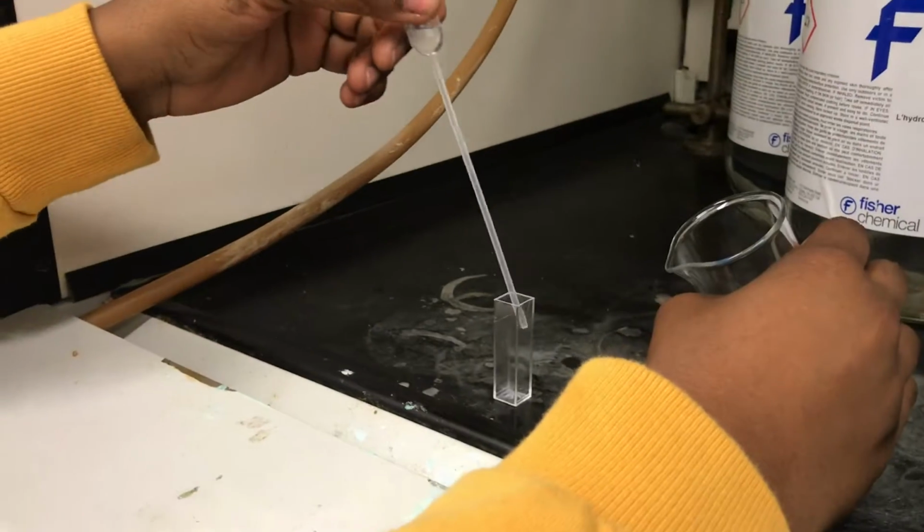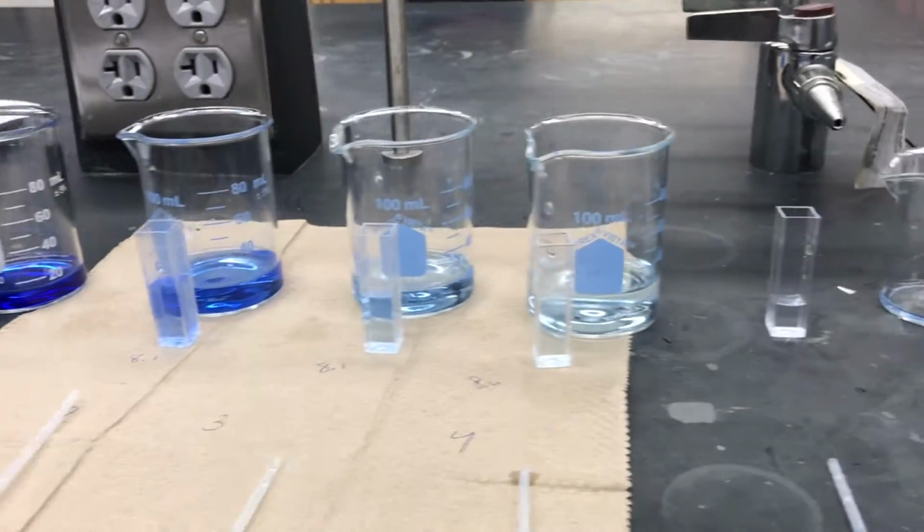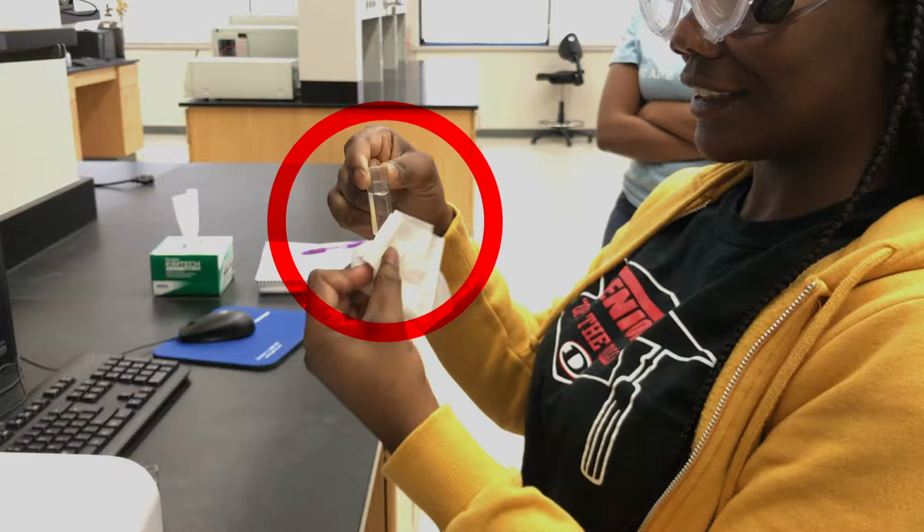In this shot, our blank of ammonia does look a little low. However, we did fix this problem off camera, as you can see here.